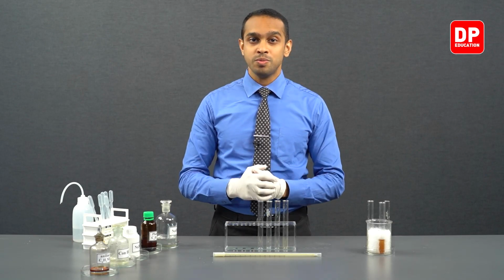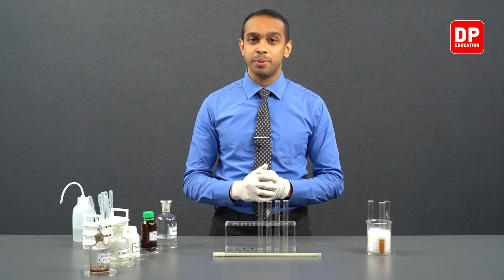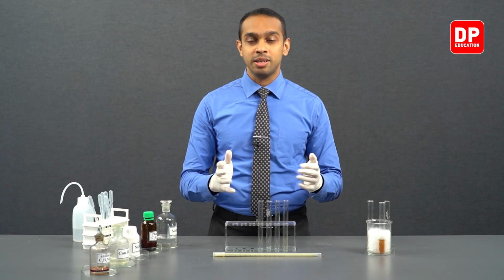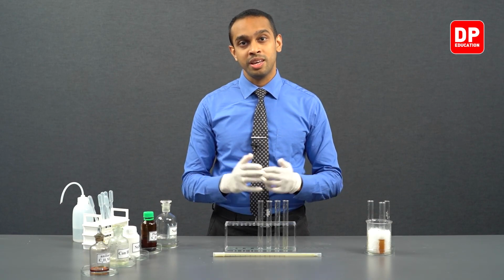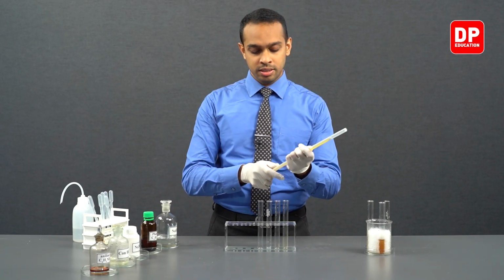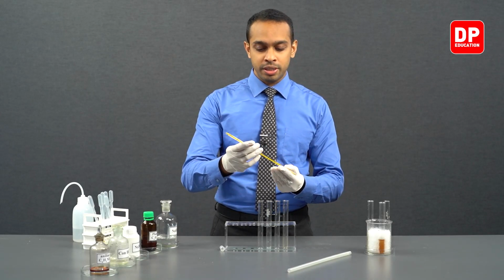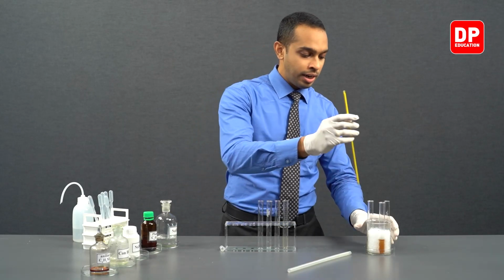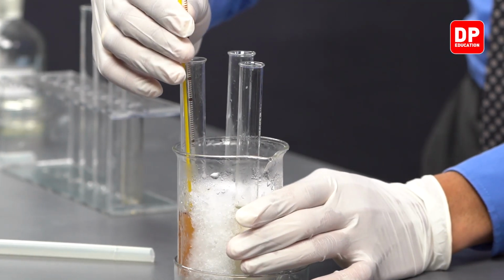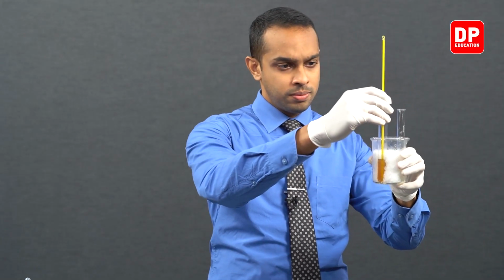So now let's observe if the solutions have reached the required temperature, so we can start mixing sodium nitrite with the aniline solution that is reacted with HCl. Now we can use our thermometer and we can observe the temperature of our aniline and HCl solution. We can see the temperature is going down.